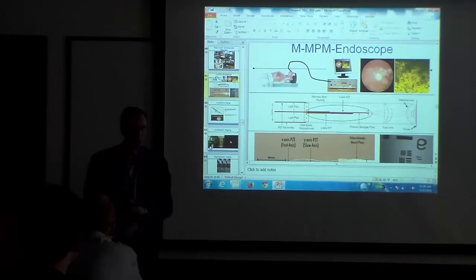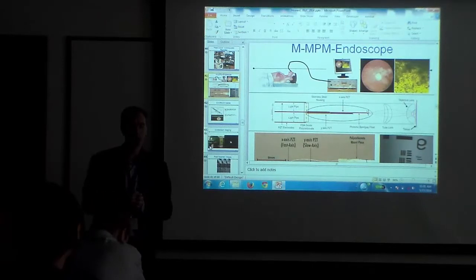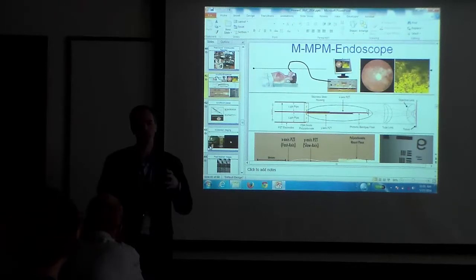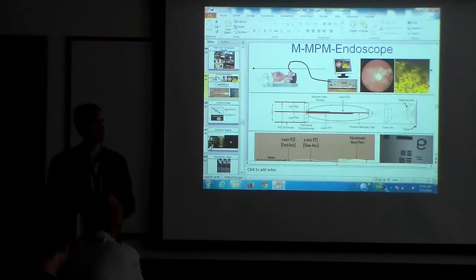But this is kind of newish stuff, especially this oxygen quenched imaging. We're using mouse models, so we're not too worried. These mice have so many other diseases that we're not too worried about what's going to happen to the oxidative stress. But eventually, that's something we should quantify and look at. I believe that's what you're asking?